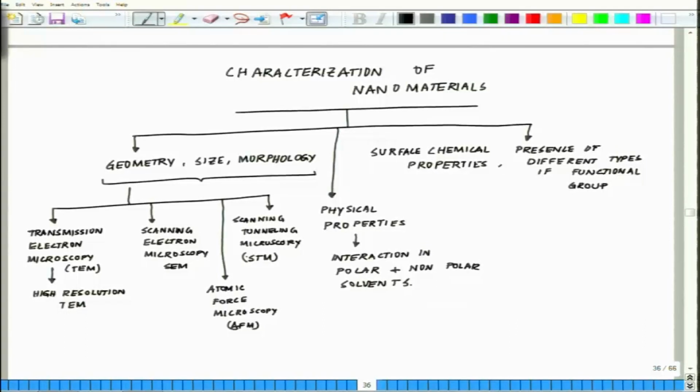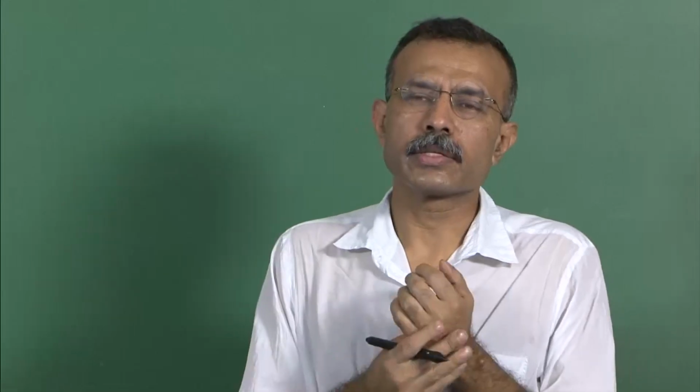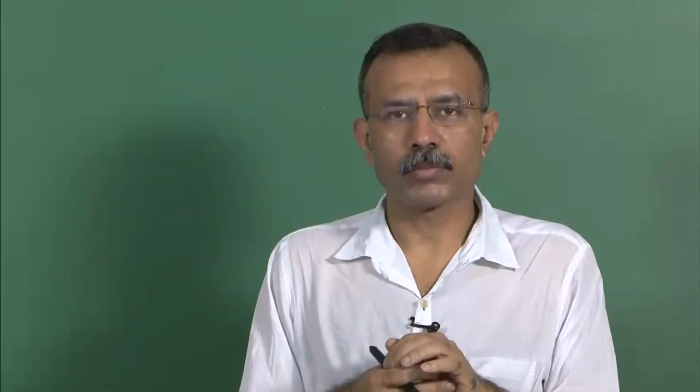These are the 4 different microscopy techniques which are being utilized to understand the geometry, size and morphology of different kinds of nanomaterials.